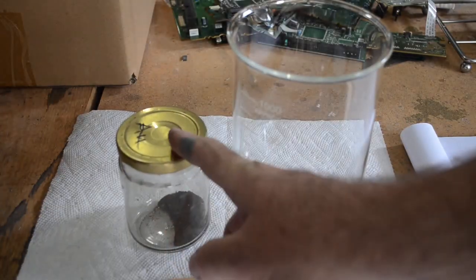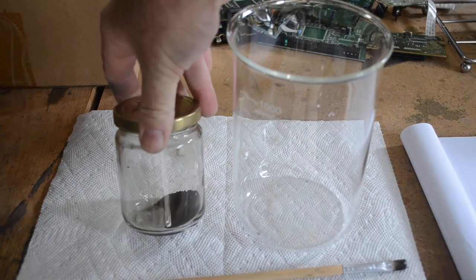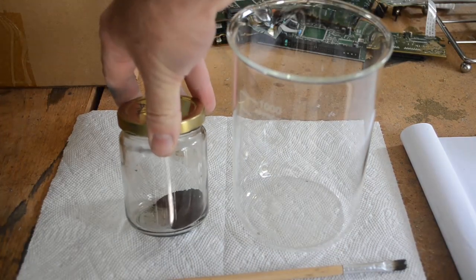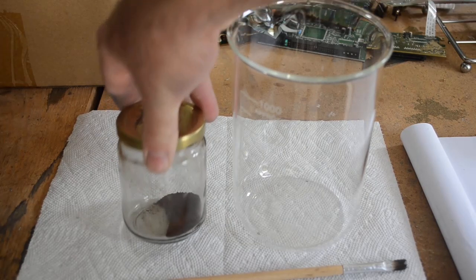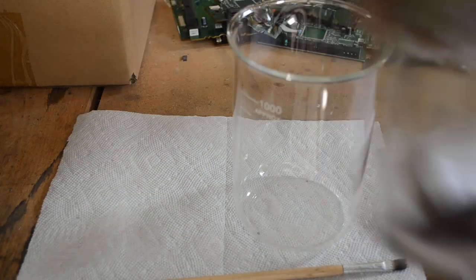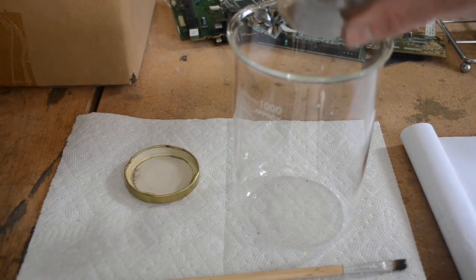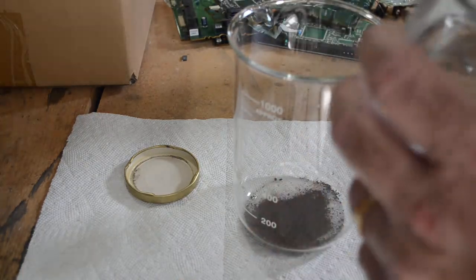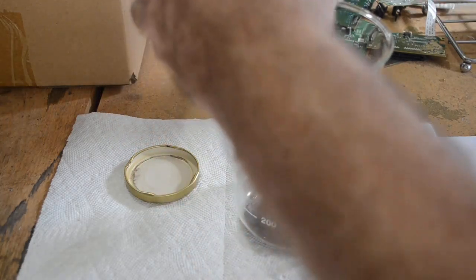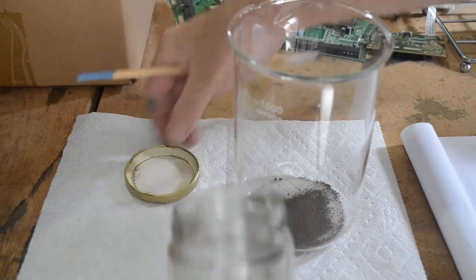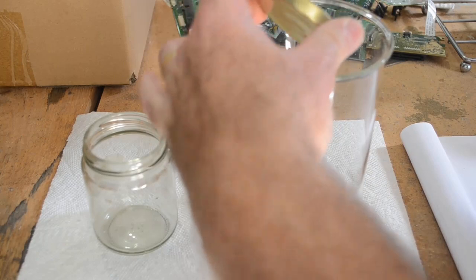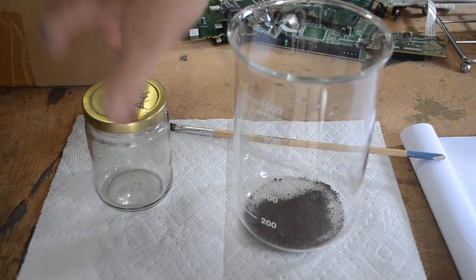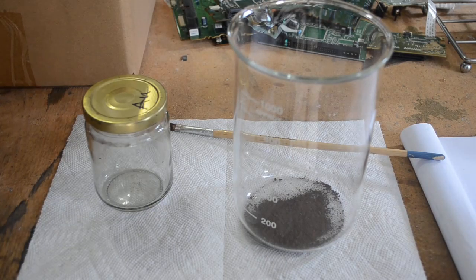I like to process my gold at least three times using different precipitating agents to get very clean gold, because different precipitating agents will bring down different things. Like SMB will bring down gold and platinum group metals, but other precipitating agents will only bring down the gold. So I like to refine it three times, make sure it's good and clean before I melt it down and get good 24 karat bars.